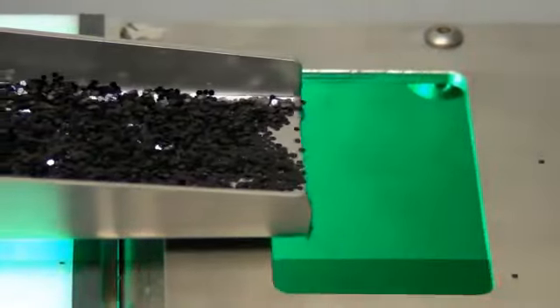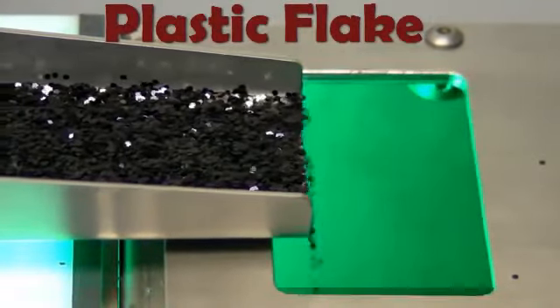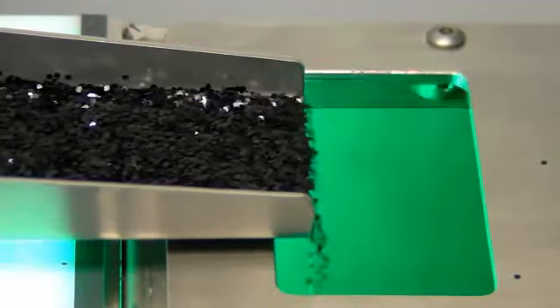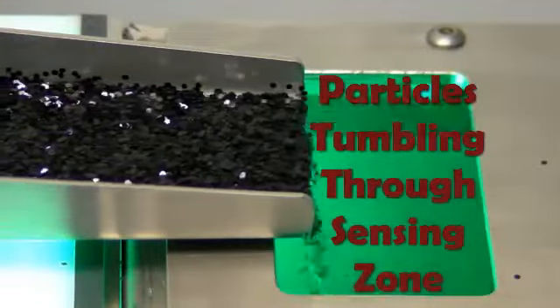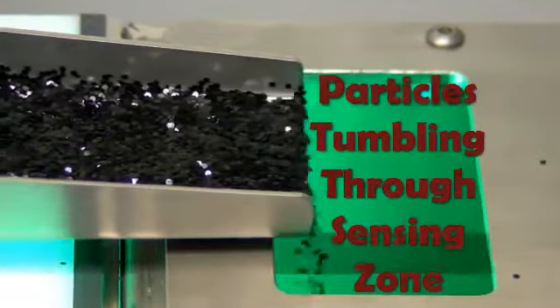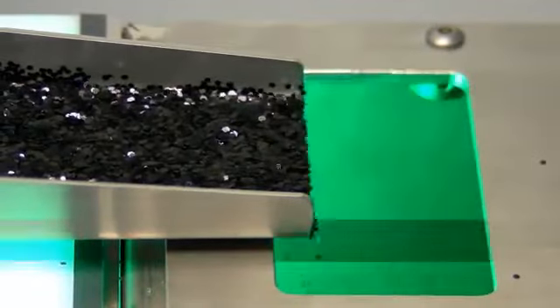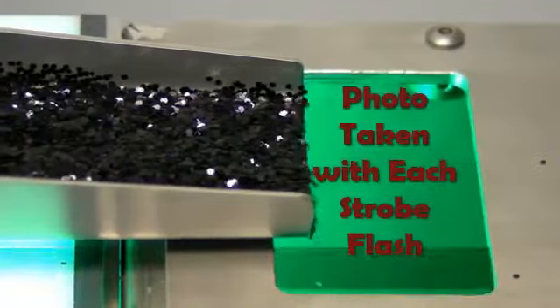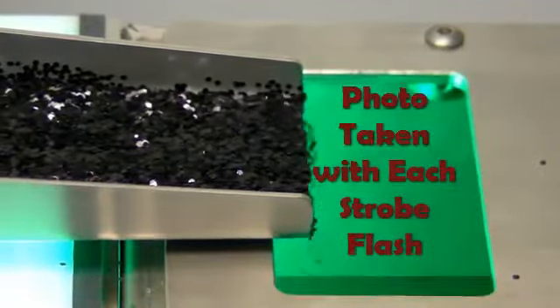Here's our plastic flake feeding into the analyzer. And you can see the particles tumbling down through the sensing zone. The moving lines are an artifact of the non-synchronization of our video camera speed and the strobe frequency. A photo is taken with each flash of the analyzer's strobe light.